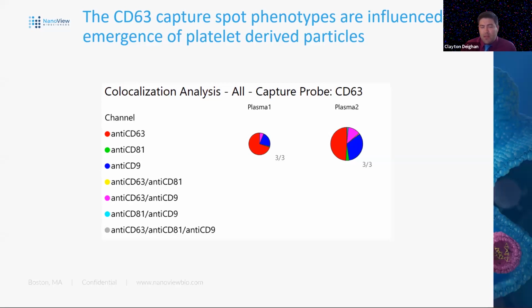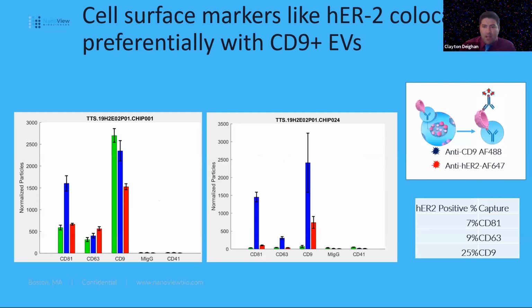And you can see it really clearly here with the enhanced colocalization of CD9 onto the CD63 spot in the presence of many CD41A derived particles. So that's all fine and good. That's interesting. We've got the same size particles coming from everywhere. We can entrain multiple of these common exosome markers on them. Even platelets can bud off particles that are small and display 63, 9, and 41A. So what about markers that are a little more interesting?